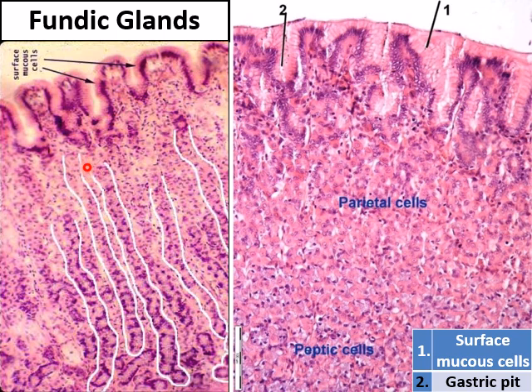Okay, I want to study the gland. The fundic glands here are crowded. This is the pit. Pit to gland ratio is 1:3 or 1:4. Dear students, look here. This is the pit. Pit to gland ratio is 1:3 or 1:4. The pit is narrow and short.